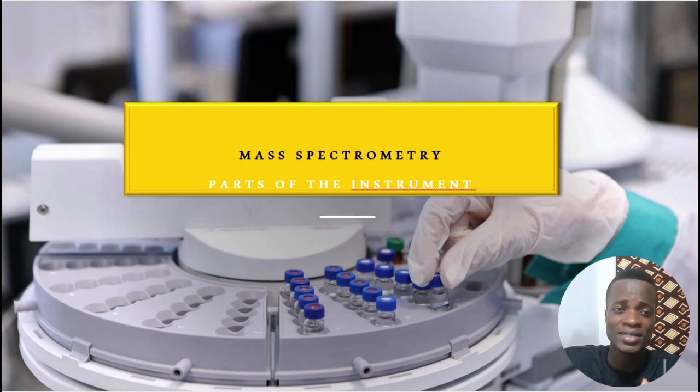Because we wanted you to understand relative abundance, because that's what we use the mass spectrometer to evaluate. So the mass spectrometer is basically the instrument that will help you to actually calculate those relative abundances. We want to go through the process and understand how different parts of this instrument come together to make sure that we're able to evaluate the relative abundances and then calculate the relative atomic mass of elements in general.